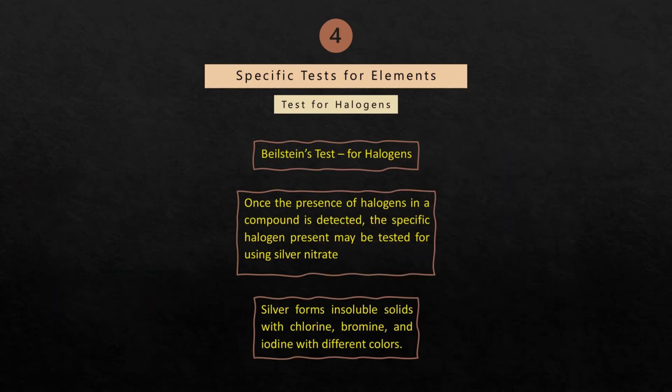The Beilstein test is the most used procedure in detecting for the presence of halogens. Copper wire is heated and dipped into the test mixture for reaction. The different complexes copper may form with the halogens usually give a green flame when exposed to a Bunsen burner flame.